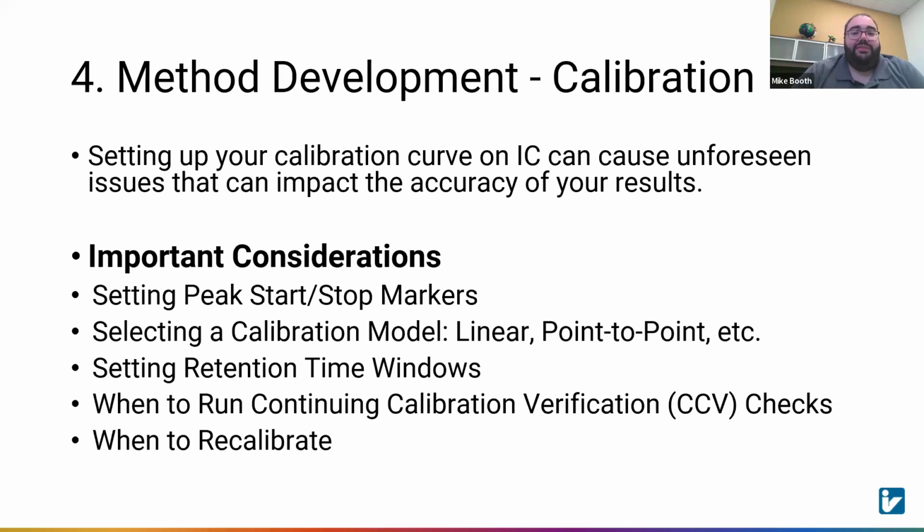And lastly, because throughput is such an issue on ion chromatography, consider when you need to recalibrate. I mentioned earlier we have a workhorse method that we test all of our custom products on. We don't recalibrate that method daily.